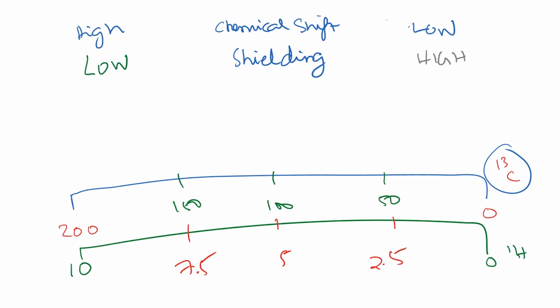For example, this region, if I draw dotted lines here and here, this region on the right, where in carbon 13 it operates between, let us say, 0 and 50, is called highly shielded, and the other side is called very poorly shielded, or low shielded, or deshielded.